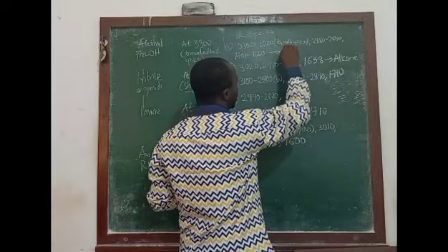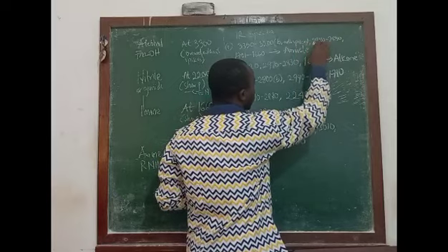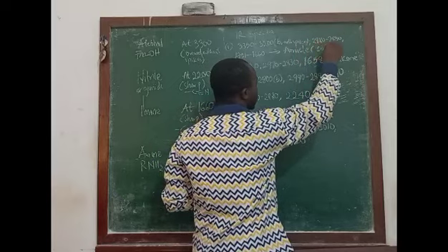We said this one is an amide, saturated one, saturated.